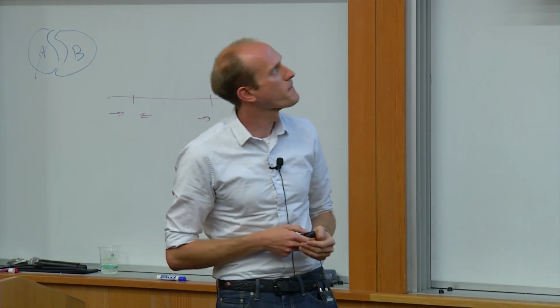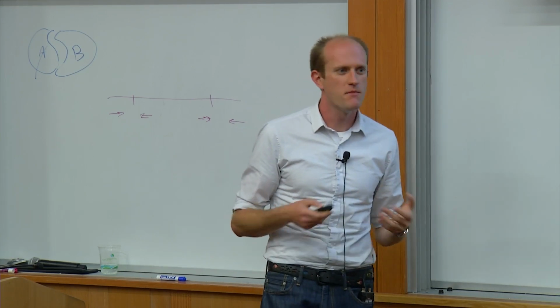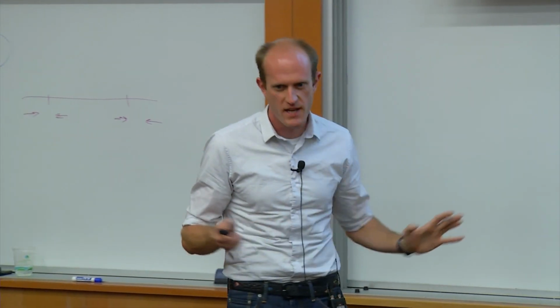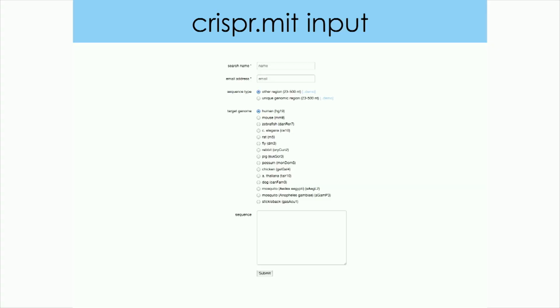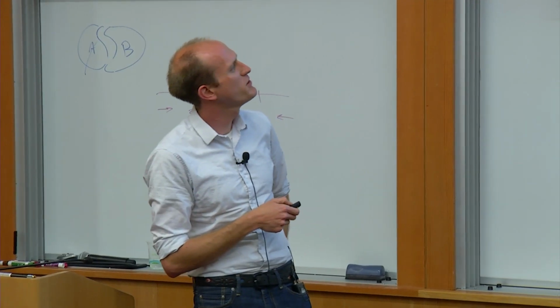The system, I'm going to very briefly just show you guys, in case you haven't seen them, what they look like. By now, there's a lot of different species that get put into these. So for example, if you're interested in plants, I think Arabidopsis might be in here. Mosquitoes are certainly in here. A bunch of, I guess plants are not in this one. They might be in Chop Chop. Arabidopsis is? Okay, great. I still can't see it. I'm blind. Oh, there it is. Great.